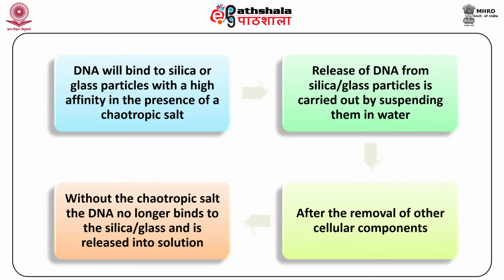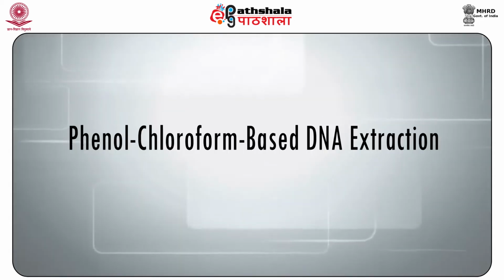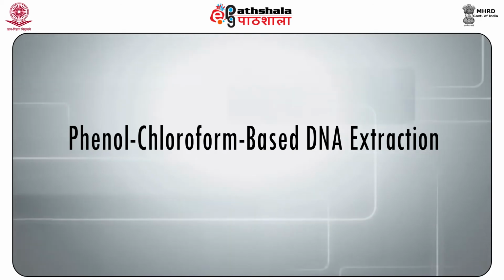DNA will bind to silica or glass particles with a high affinity in the presence of a chaotropic salt. Release of DNA from silica or glass particles is carried out by suspending them in water after the removal of other cellular components. Without the chaotropic salt, the DNA no longer binds to the silica or glass and is released into solution.